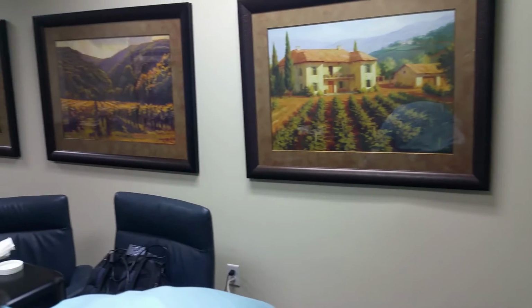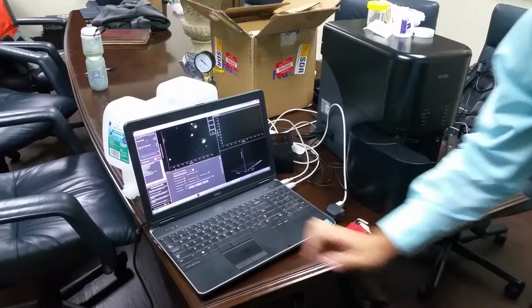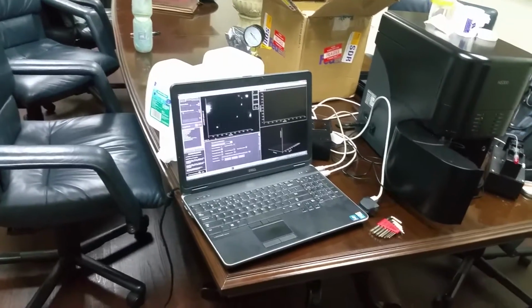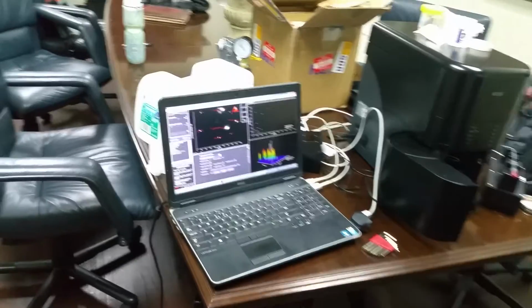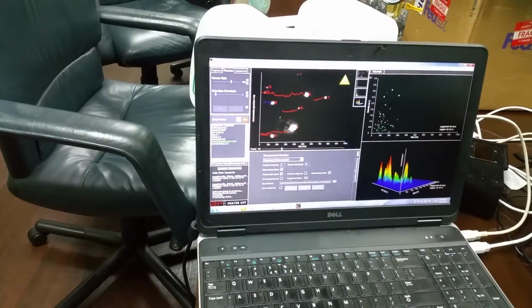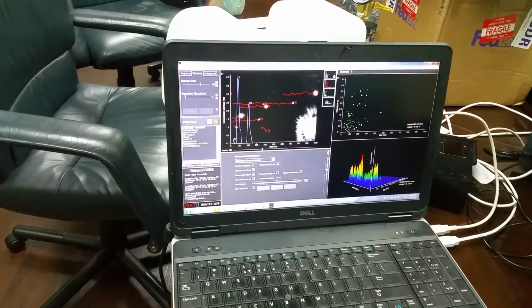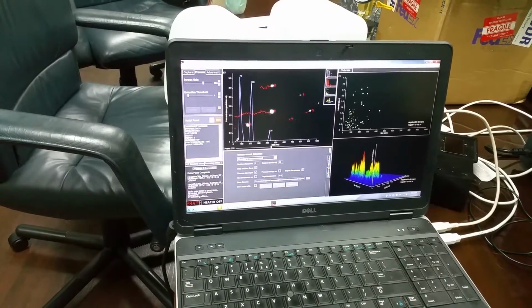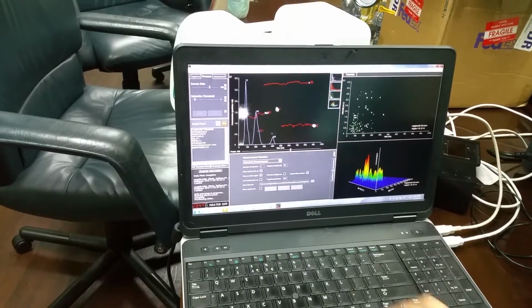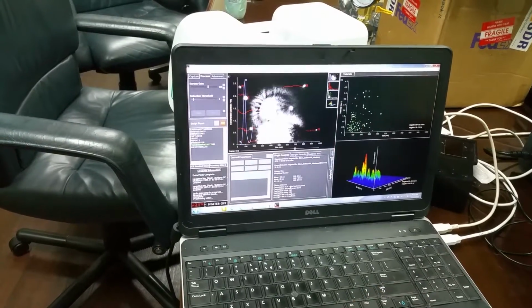This is running through it live right now, and this is all being videoed. Yeah, and this is the track. Now we're under the track, and we've taken 3 30-second captures of the particles moving under Brownian motion, and now you'll see the tracks drop out behind them. All the red tracks are a particle whose size has been validated based on tracking for multiple frames. And we see a size distribution start to develop. And we can put it in the analysis. We get a number count from this.